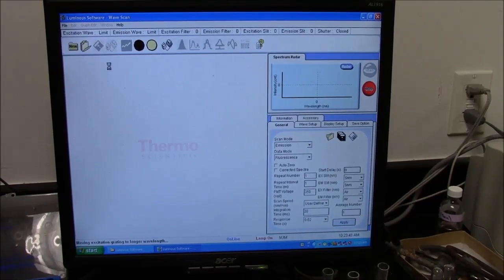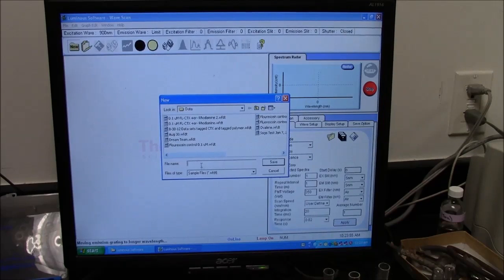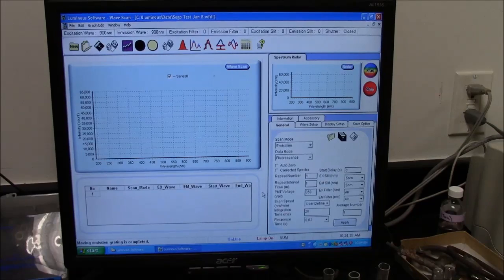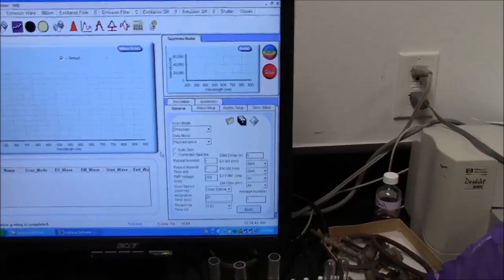To start collecting data, we click on this button in the corner that says New. And now it says, what do you want to call this experiment? I will call this experiment "test Jan 8." In this case, I could give this a title. I'll just leave it as test. So now you can see there is a graph that comes up, intensity on the y-axis and wavelength on the x-axis. So similar in concept to a UV spectrum, but in this case we're measuring the emission of light, and counts will be how many photons were detected. The controls for the experiment are in this corner here.